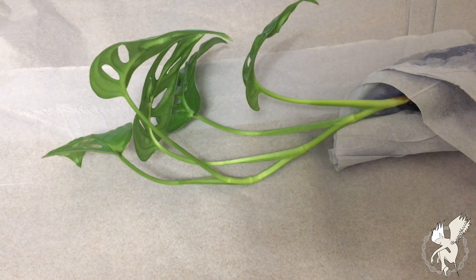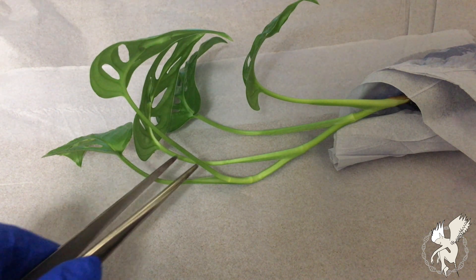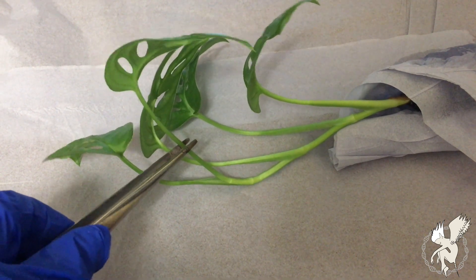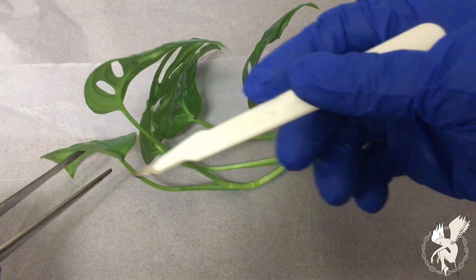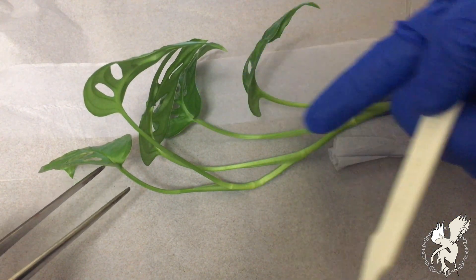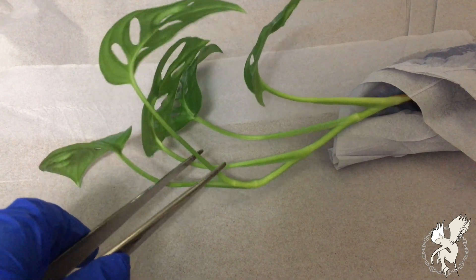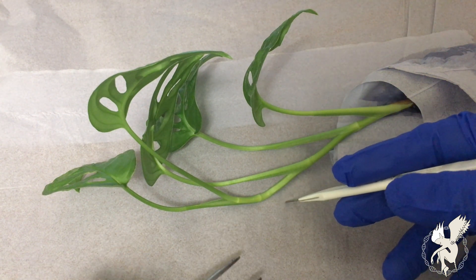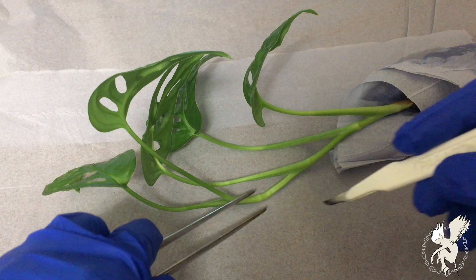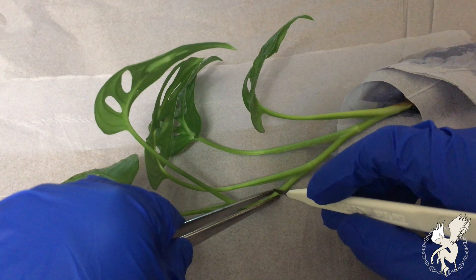The part of the plant you're interested in tissue culturing is right here. This part is called the apical meristem, and it's capable of producing newer cells. You'll need this particular part, and you'll need to cut it here at the stem.